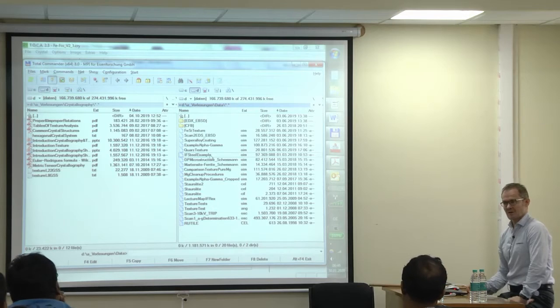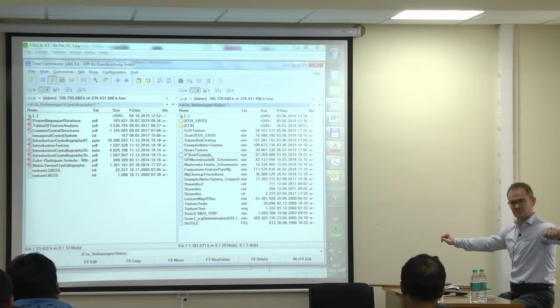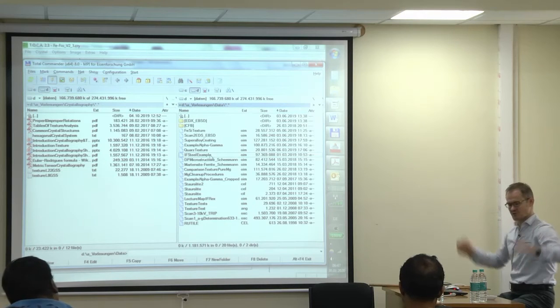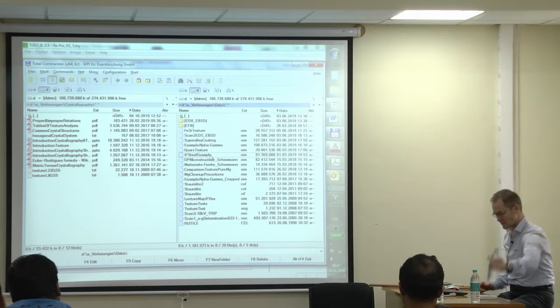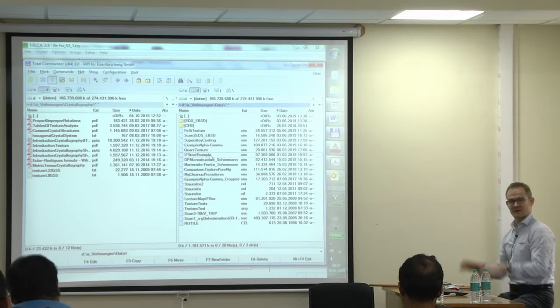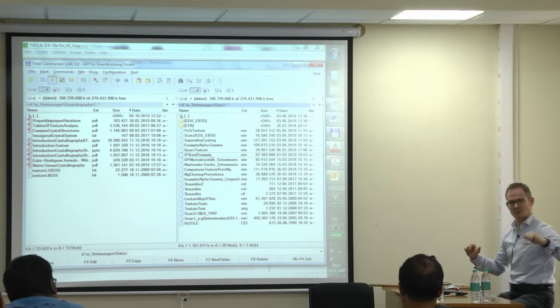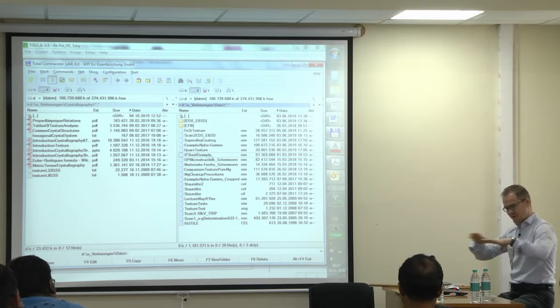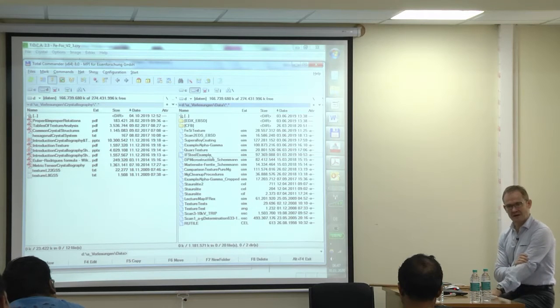So what you will see now as an example is a sample of an interstitial free steel, which is used for deep drawing applications. That means you create it in sheet form, and then you use this, for example, to make cans out of it and so on. For these materials, texture plays an important role. If the texture is not correct, you will get earring during the deep drawing process. You will get different thickness in different directions after deep drawing. So that's a big problem. And the question is, do we get the right texture?